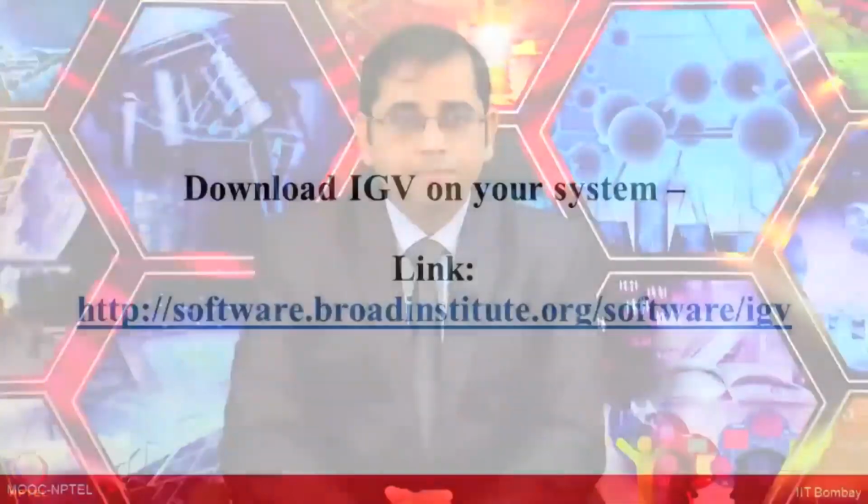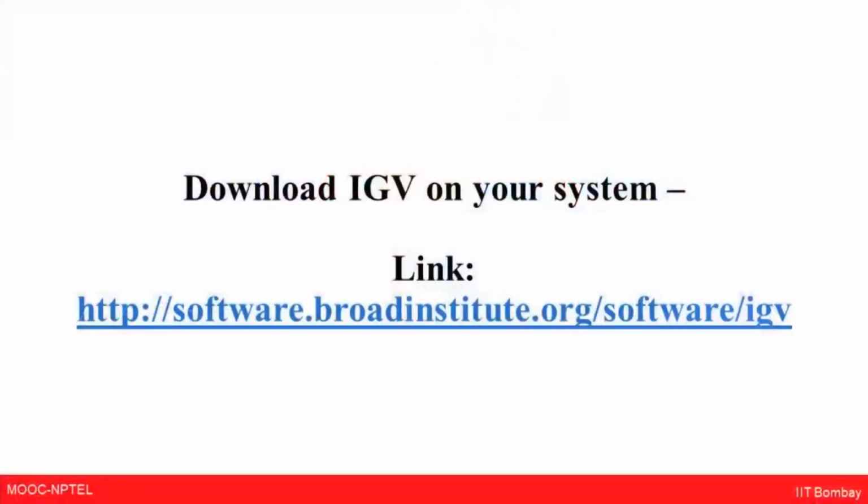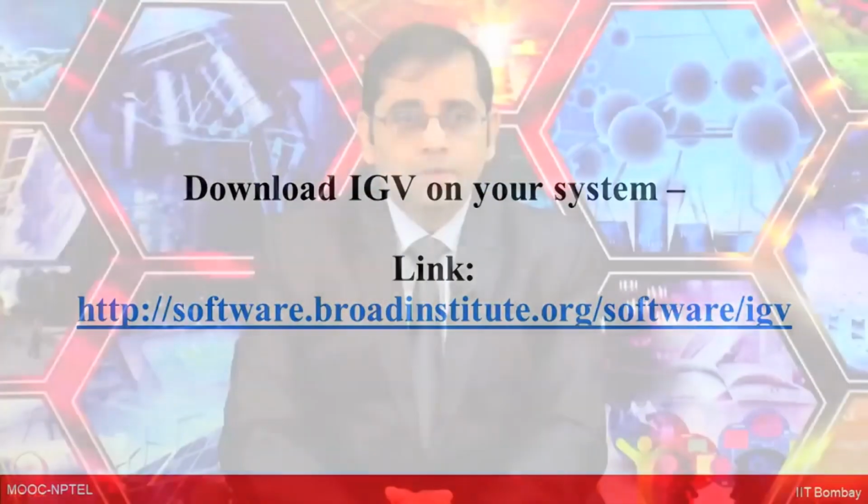The prerequisite for the hands-on is to download IGV on your system. You can see this link on your screen. If you have not downloaded IGV yet, please pause this video and download the software to move forward. Keep a note, you need to have Java on your system before you start using this software and this hands-on session, else IGV will not work.